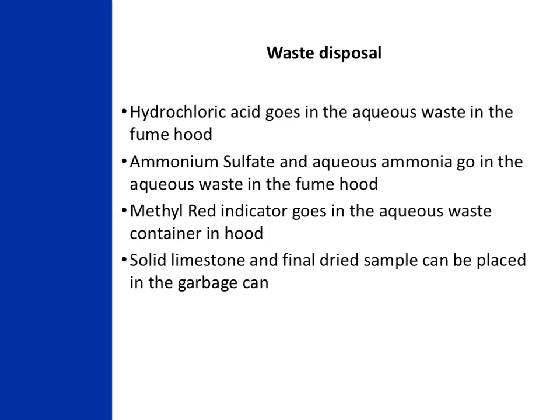This experiment is the first experiment where we will be using hazardous chemicals. These substances must be disposed of in a particular manner following local and federal regulations. Your TA will instruct you on the specifics of waste disposal during each lab period.